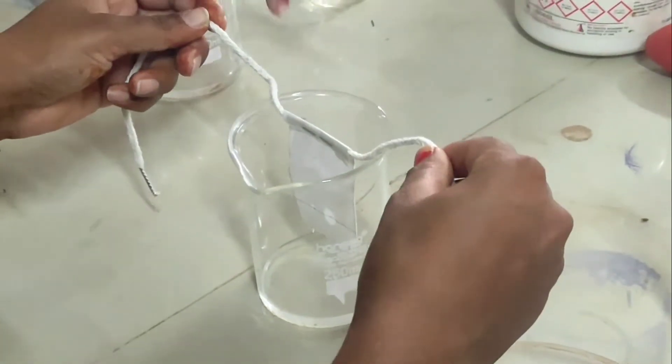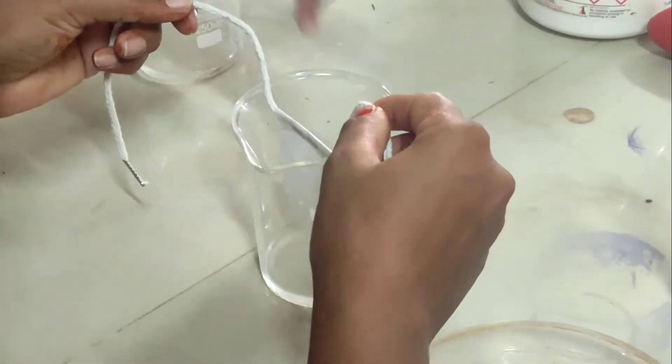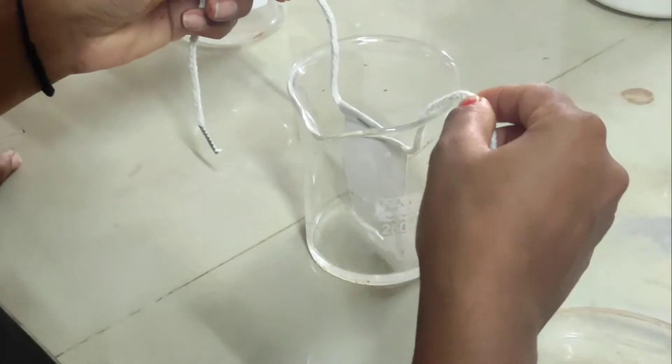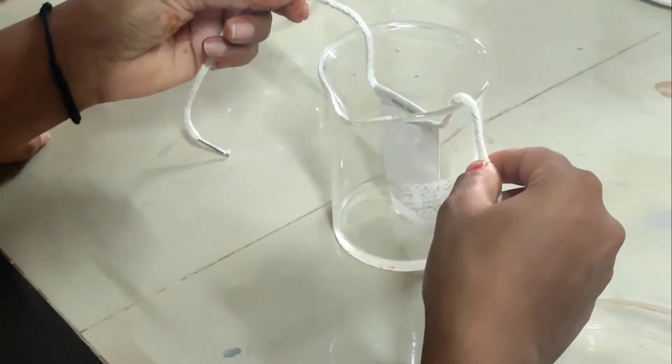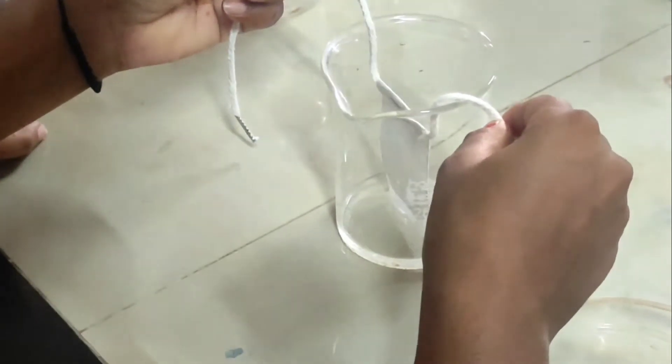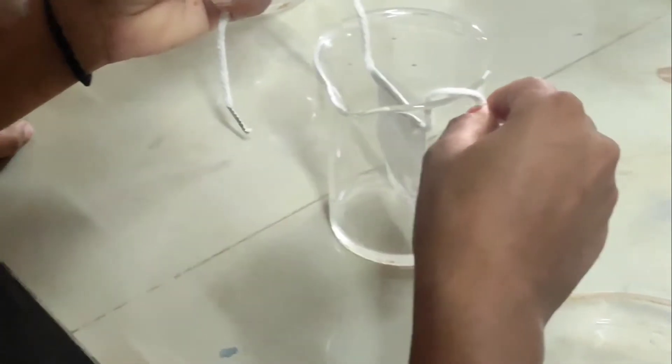Now the solvent is rising by capillary action against gravity, as you are seeing in this video. Meanwhile, we have prepared our spraying agent that contains potassium permanganate and sodium bicarbonate, which is sprayed over the paper after its complete running and drying. It will give a yellow colored spot where the sugars are identified. Since our paper has reached approximately 80% of its area, we have removed the paper and marked the solvent front with a pencil. Allow the paper to dry till it completely dries.